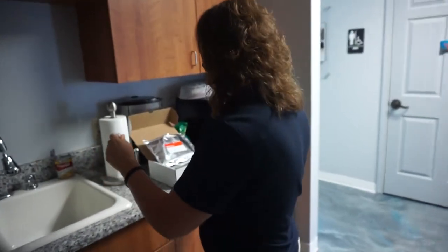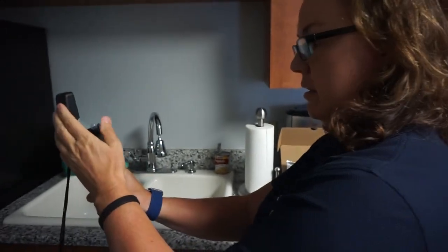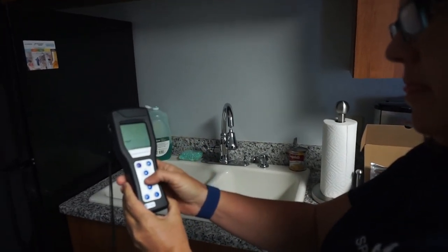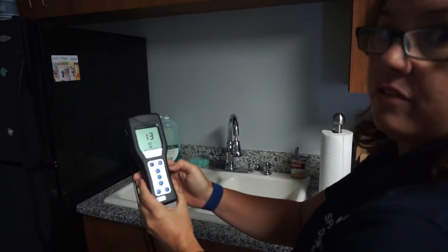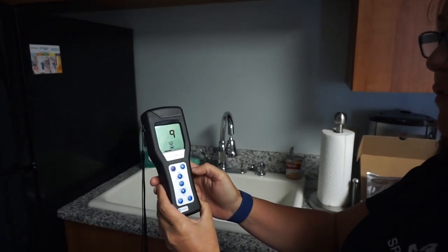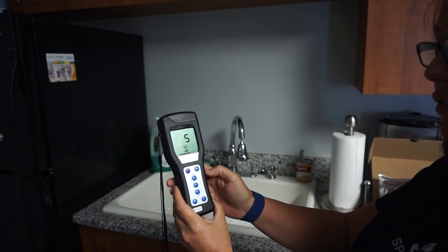Now we're going to put it in our machine — another 15-second countdown and it's going to tell us where we're at. Anything above 30 is considered unsanitary for food areas.